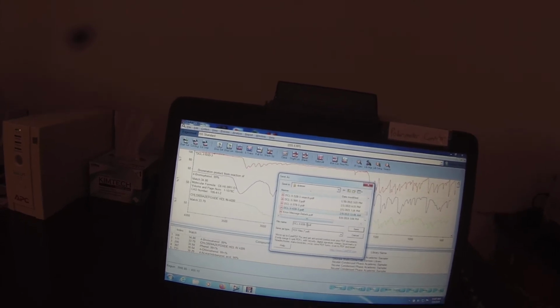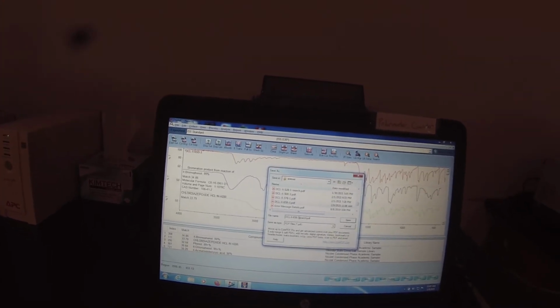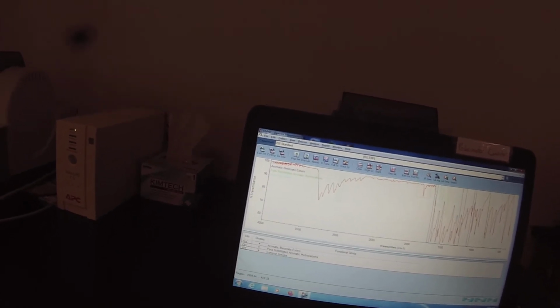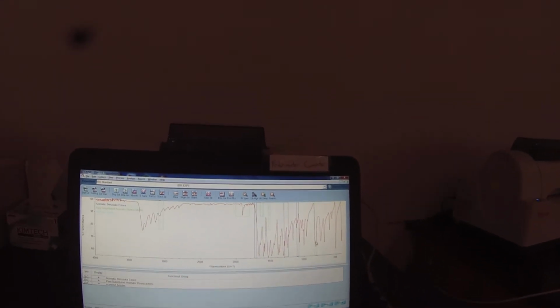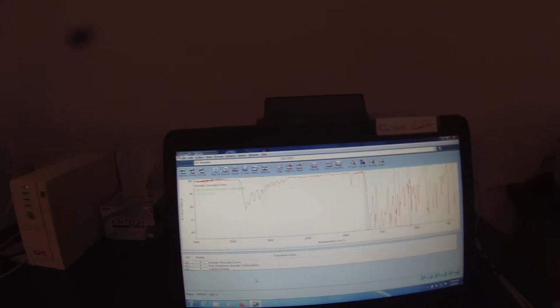So I'm going to call that DCL 10-65B-3 search. And then I'm going to do the functional group interpretation. And it thinks it's an N-phenyl amide. That's good because it is, in fact, an N-phenyl amide, right? It's an acetanilide. It thinks it's a para-substituted aromatic hydrocarbon. So you see that this peak over here, that peak at around 835, it thinks is evidence of para-substitution. And it thinks it's an aromatic benzoate ester. Well, it's not, but you know, whatever it thinks it is.